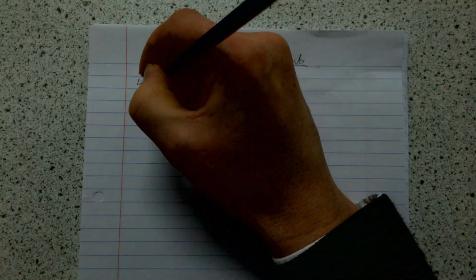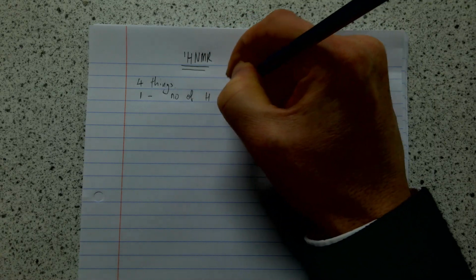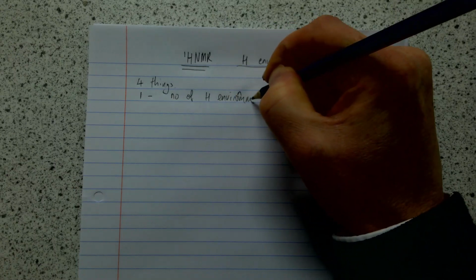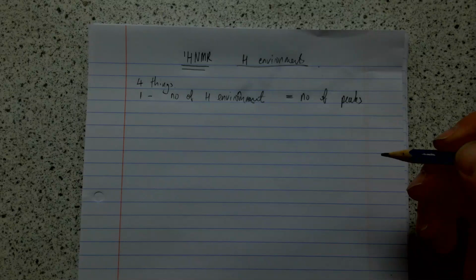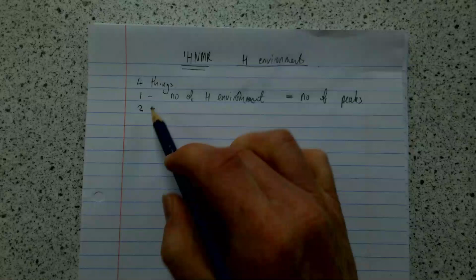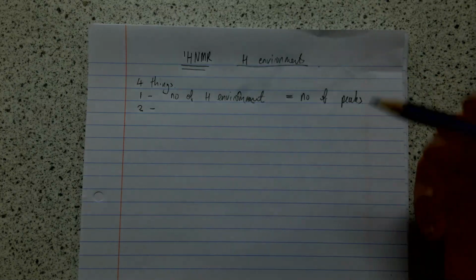The first thing we need to look at is the number of hydrogen environments in a molecule, excuse the spelling there, equals the number of peaks in the spectrum. We'll have a look at a spectrum or two in a bit, okay? The next 3 are the 3 things that you need to know for each peak. So how many peaks there are, and then for each peak there's 3 things.